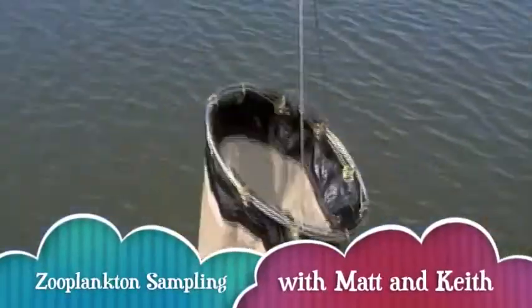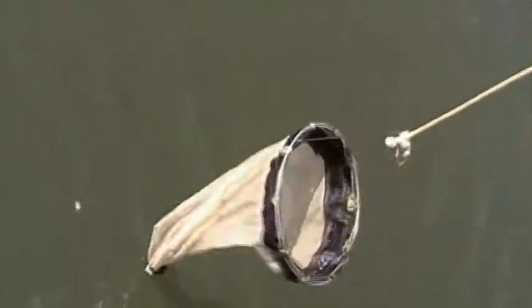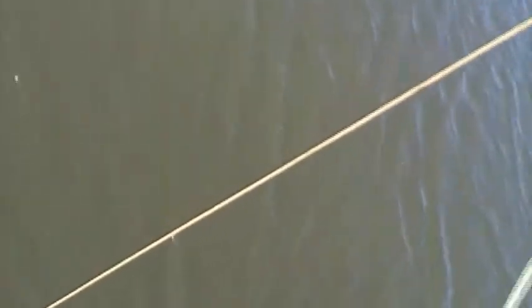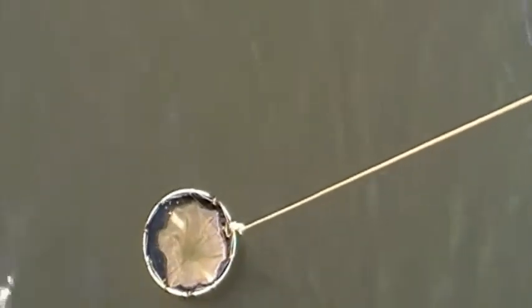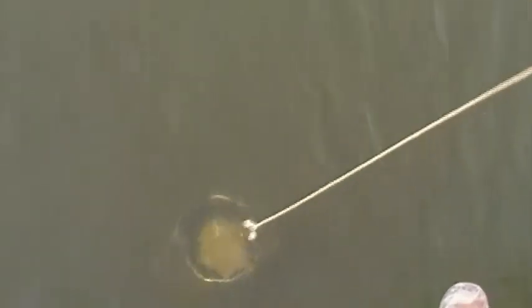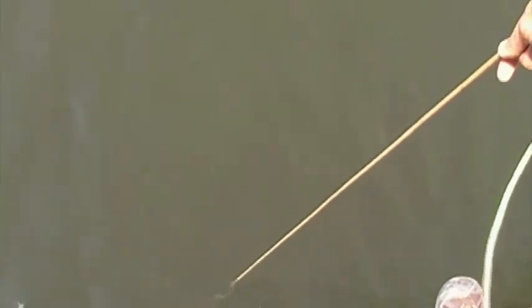Now we're going to learn how to use a zooplankton net. Lower the zooplankton net carefully into the water, making sure to keep it vertical. Then put the ring at the level of the water — that's your starting point. Then lower it down to your desired depth. Then bring it back up slowly and carefully.